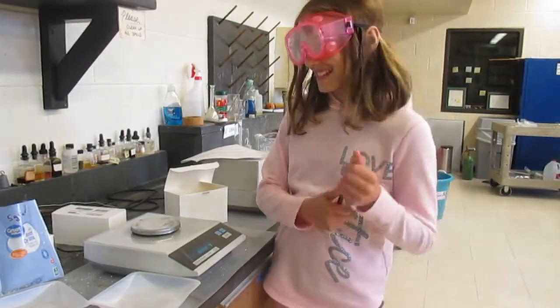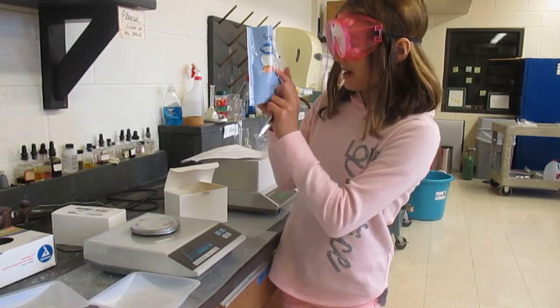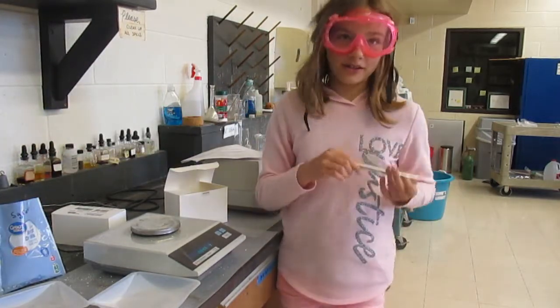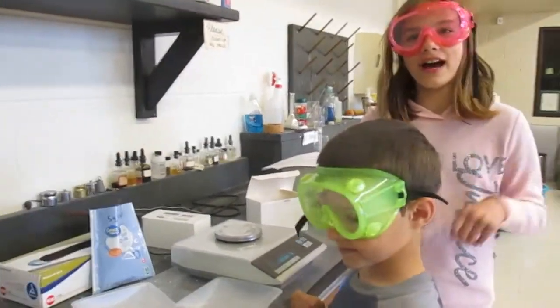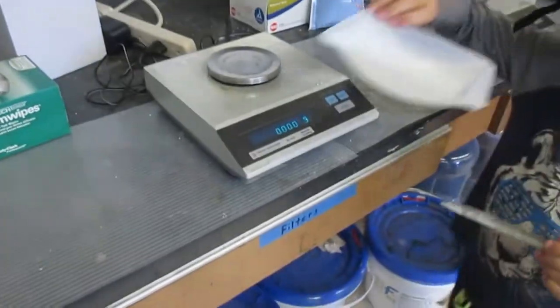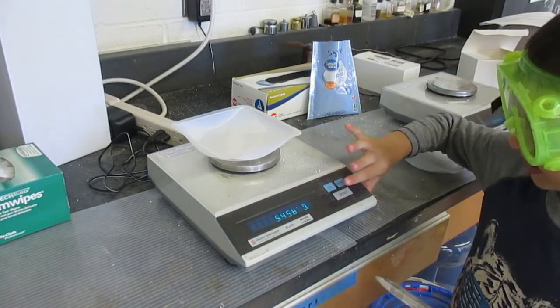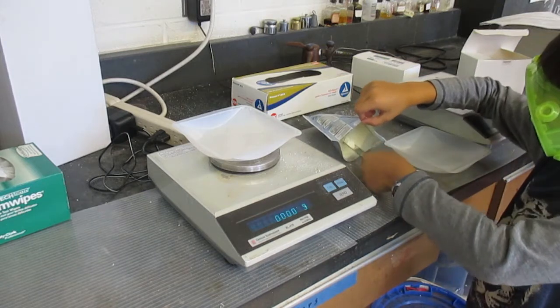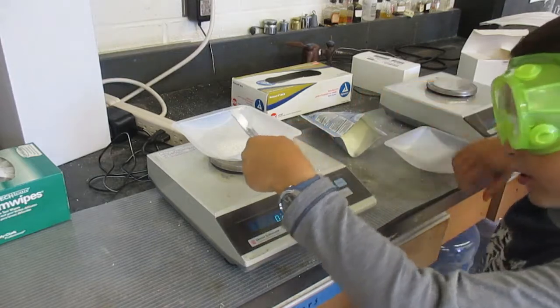Okay, so for this experiment, you're going to need approximately 5 grams of non-fat dry milk. You're going to see my brother Josiah do it, and then I'll do it, because we're going to do two trials, aren't we, kids? Yes. Okay. So you get one of these, you put it on here, you click the scale and you click zero. Get some non-fat dry milk, scoop some out, shake it in, and look at the scale.